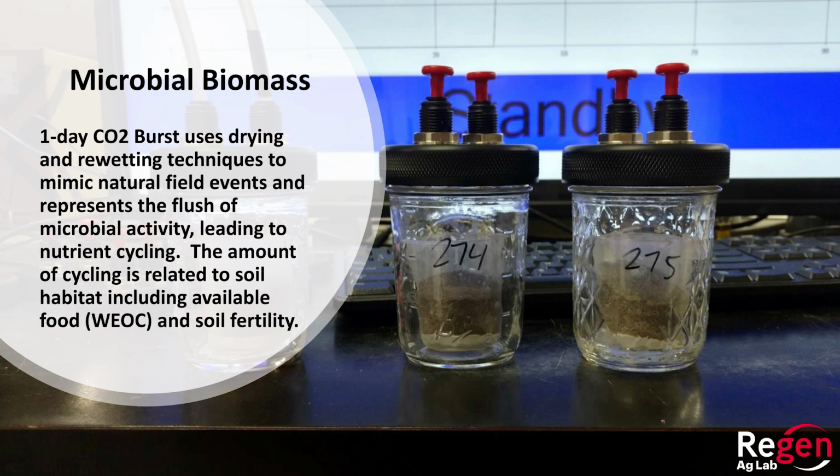Again, sticking with the theme of trying to mimic nature, we want to mimic the process. So we take a soil that's been dried, and then we re-wet it in a laboratory and we incubate it at room temperature. We capture that carbon dioxide and we measure it. Because when your soil dries and you get a significant rainfall event, you get a flush of activity, the microbes come to life, and you get this push of carbon dioxide off your soil. This is a natural process. So we don't add anything to the soil, we don't spike it with anything, we just put water with it. That's it. And then we seal it up, see what happens.